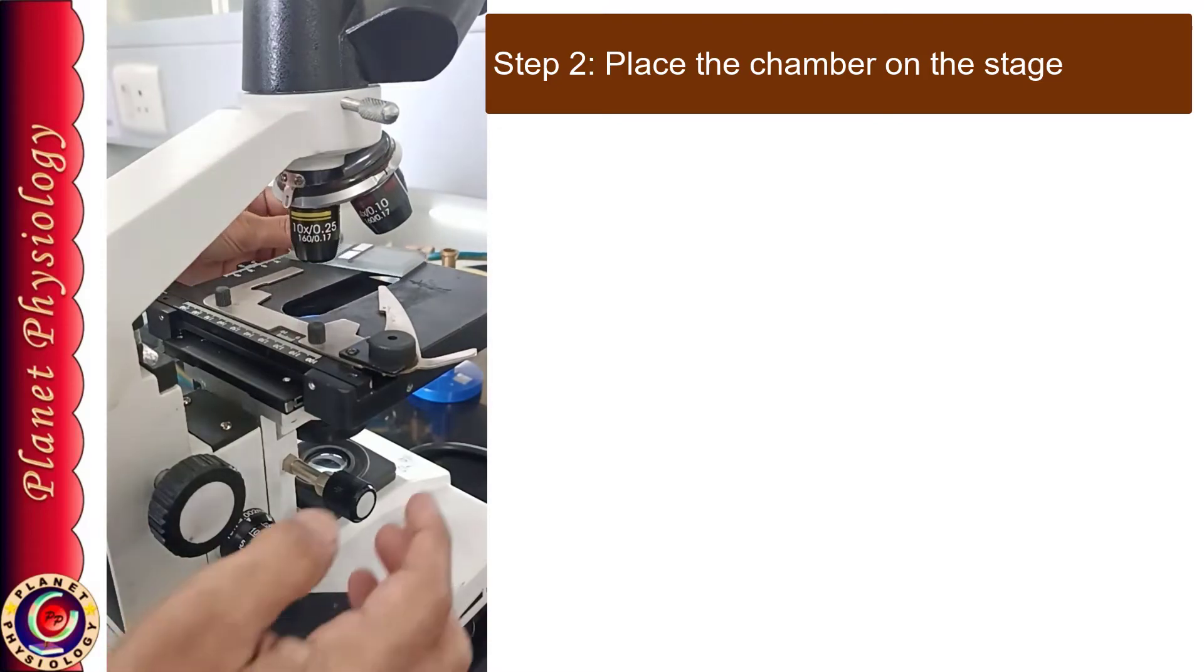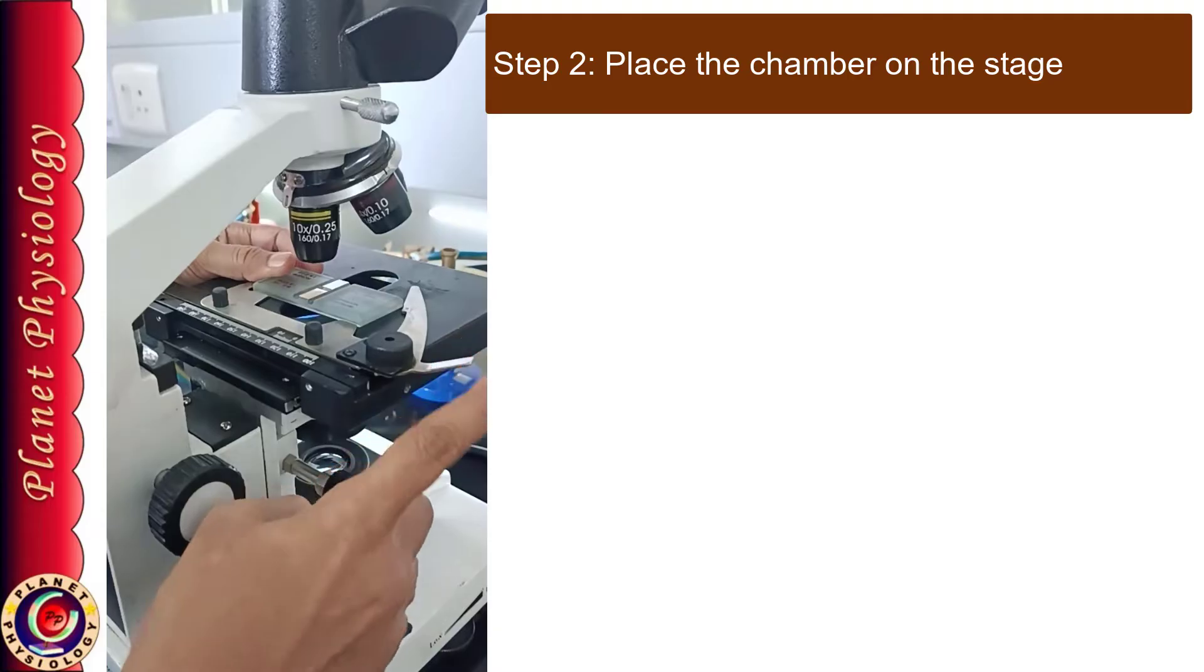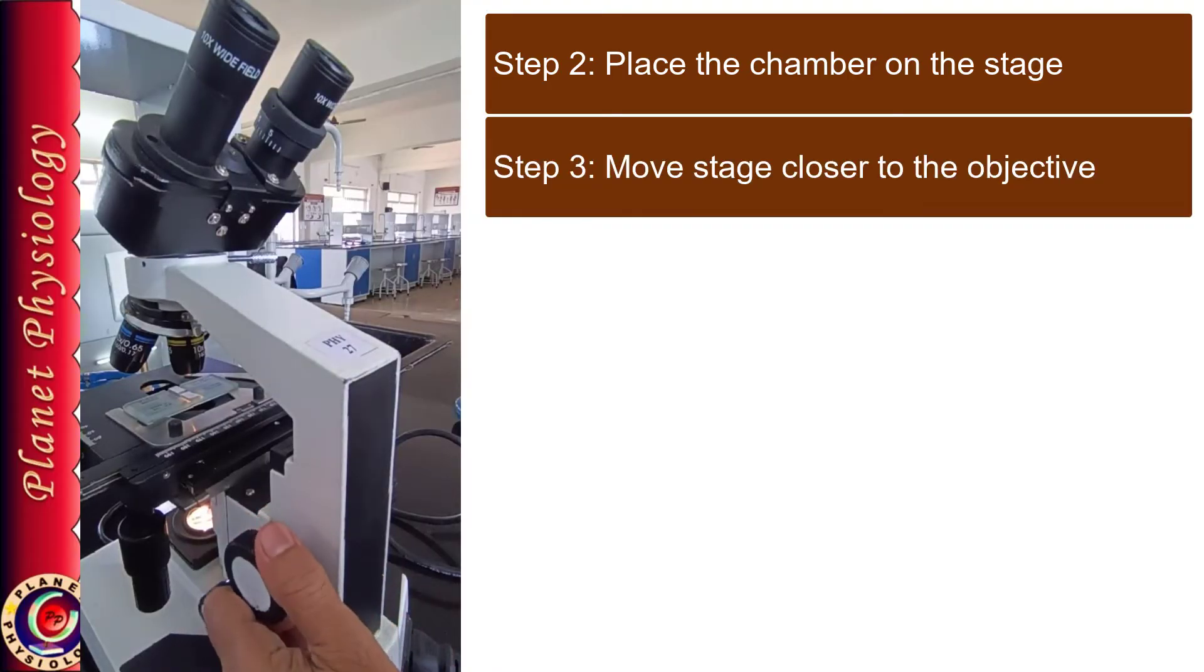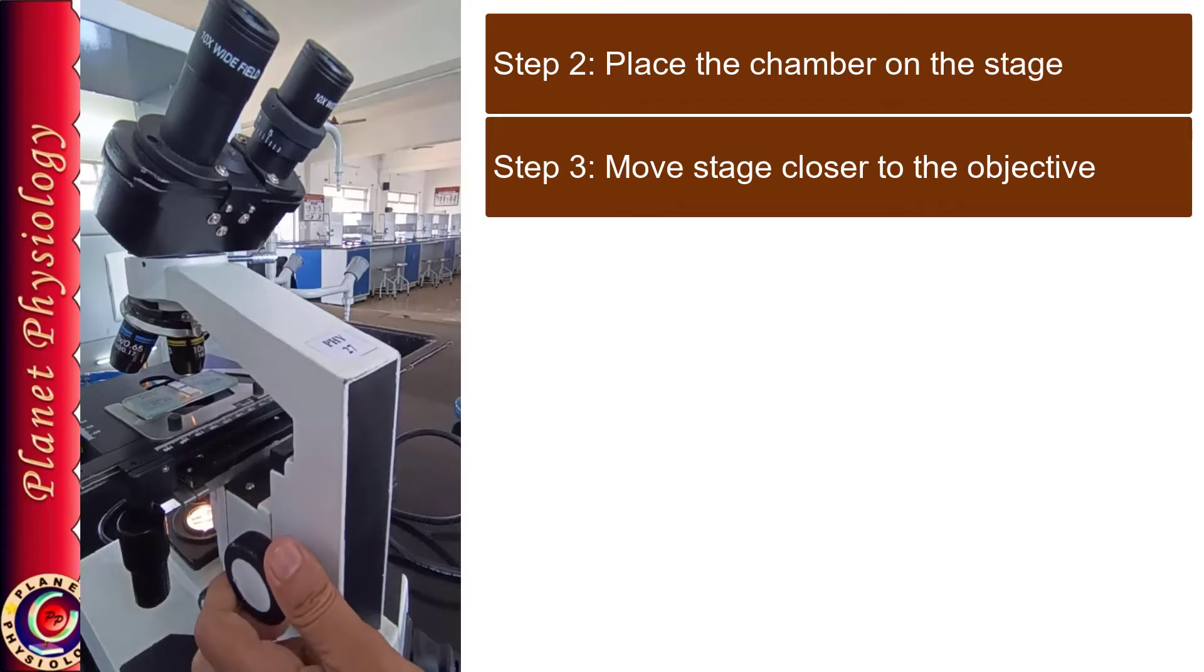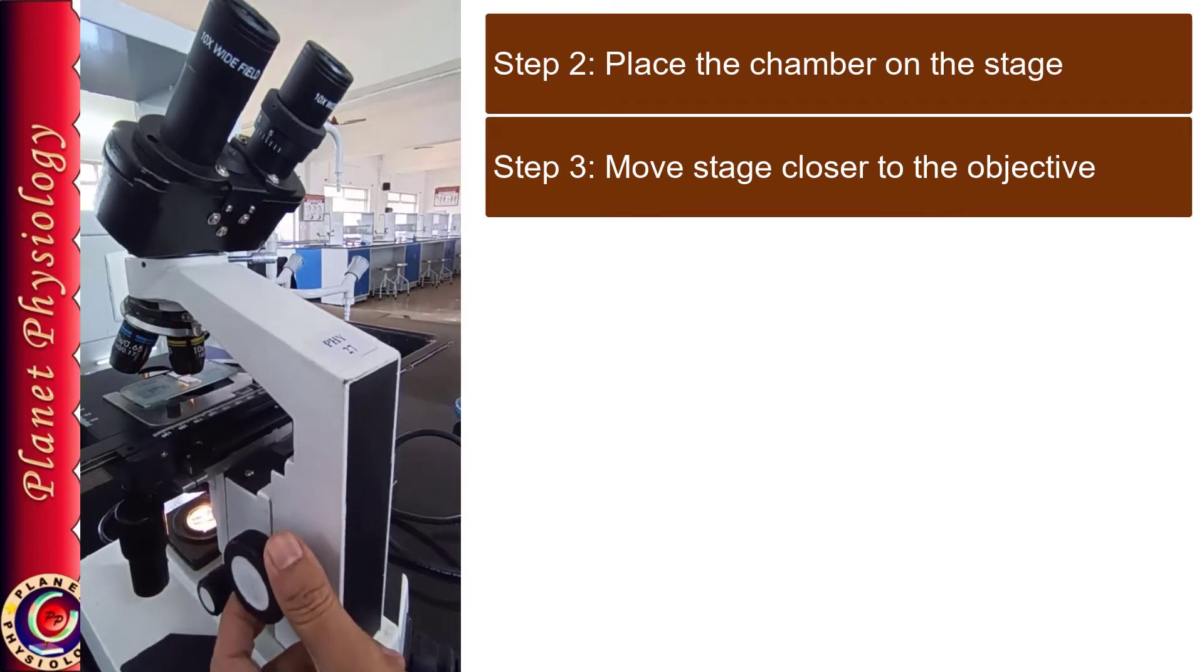Now place the chamber on the stage. Make sure that it is fitting properly in the mechanical stage. Now move the stage closer to the objective by viewing it from side. Don't hit against the objective but move closer to the objective.